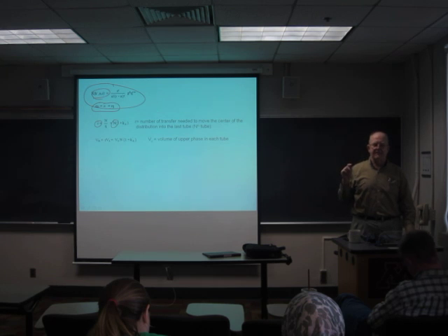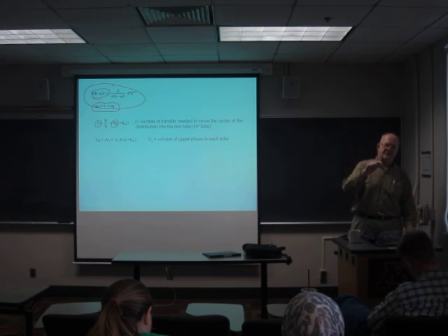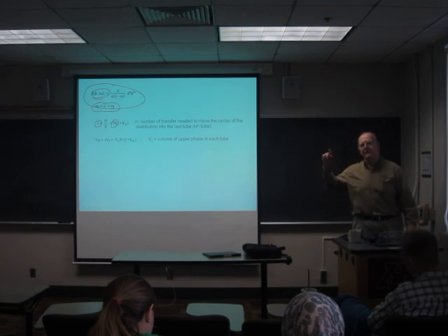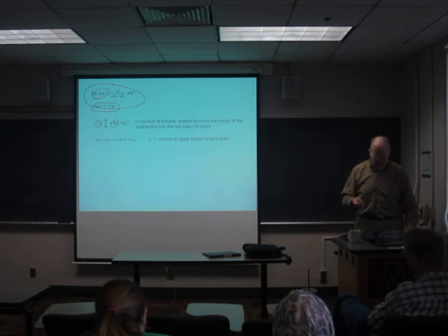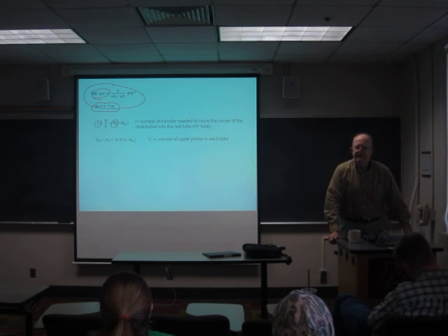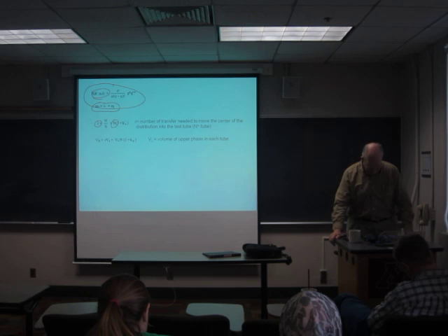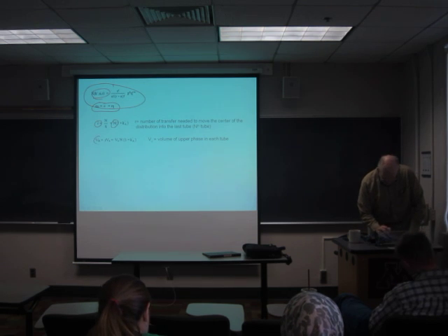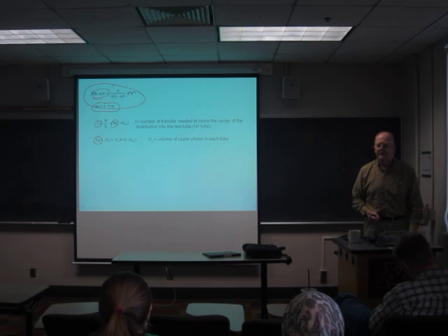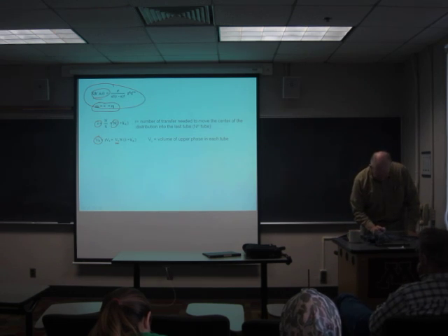The total volume of eluent needed to go into the zeroth tube to push the center of gravity from the zeroth tube to the last tube will be equal to R, the number of transfers required to do that, times VU. VU is the volume of fluid in the upper phase, that is, the mobile phase. So plugging that all together, VR, which is also called the retention volume, is equal to the volume of mobile phase in the upper part of the tube, times N, the total number of tubes, times 1 plus k prime.